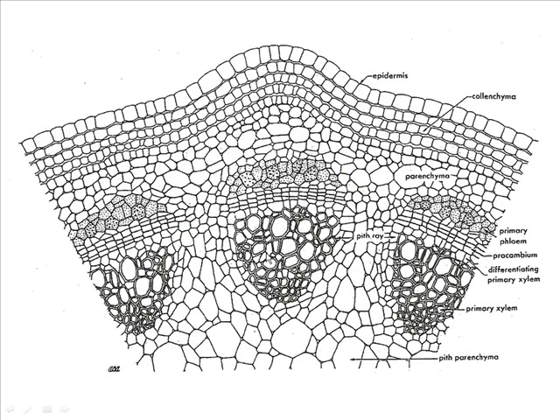Let's look at this one. Oh, this is from your handout. And so this is kind of a review. On the outside, we see epidermis. What's this layer of brick-like cells just inside the epidermis?